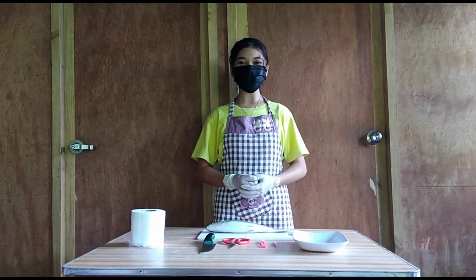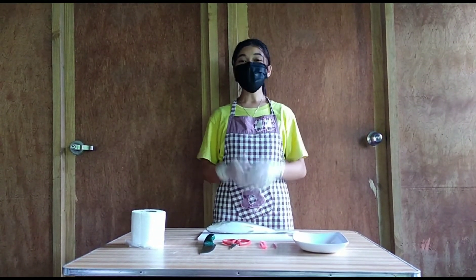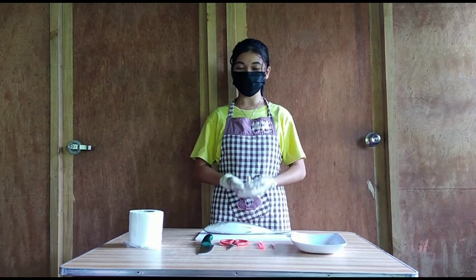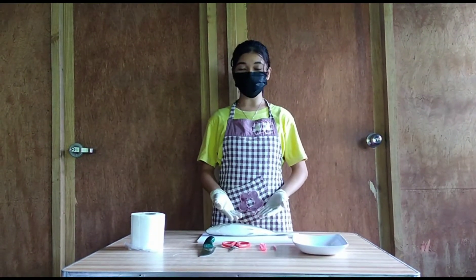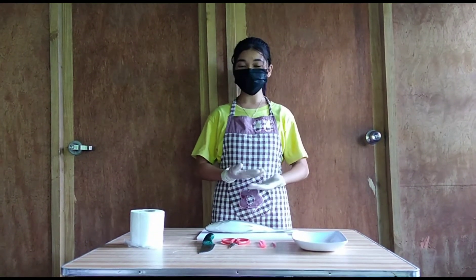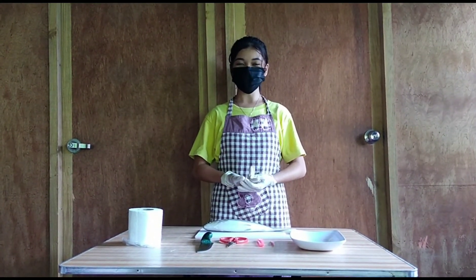Good day! I am Patricia T. Urashong from Beetle Ed 1A. For today's video, I am going to show you how to dissect a fish. I am using bangus or milkfish, and I am also explaining the parts and its internal organs. So keep on watching!